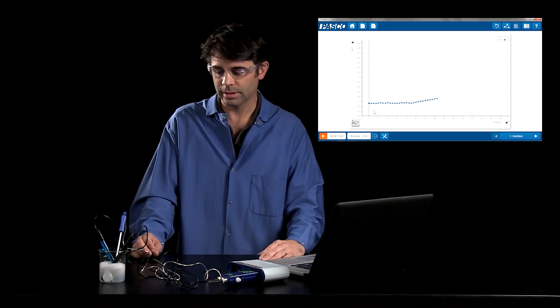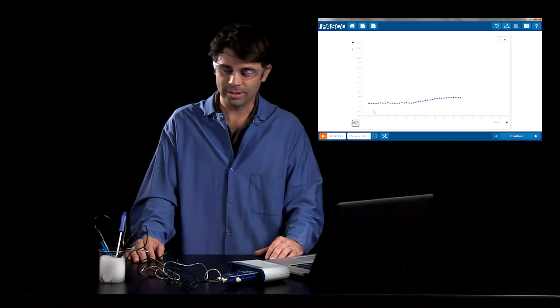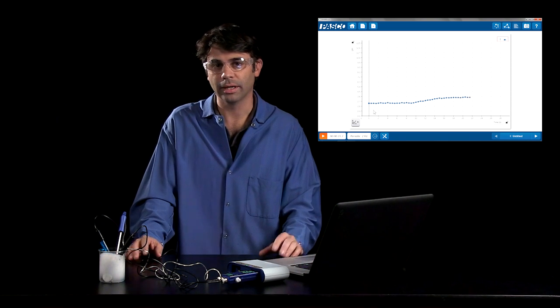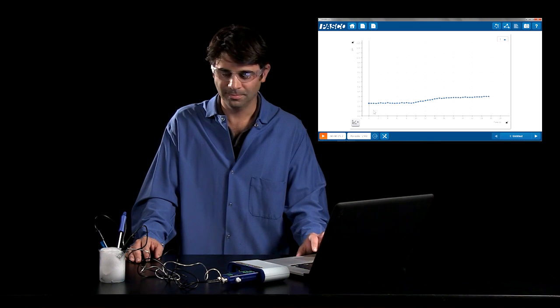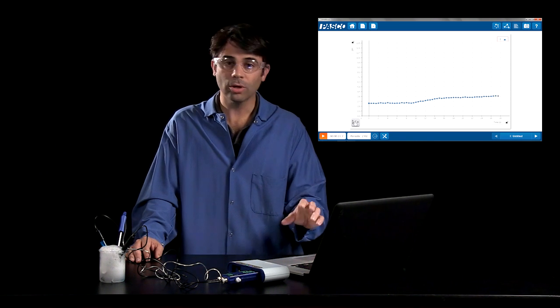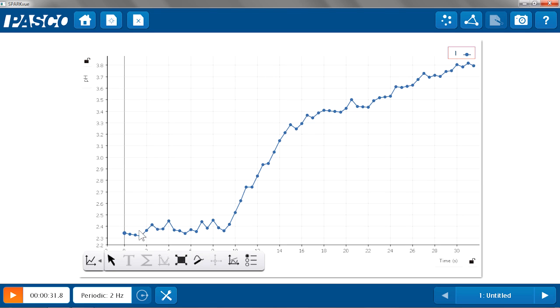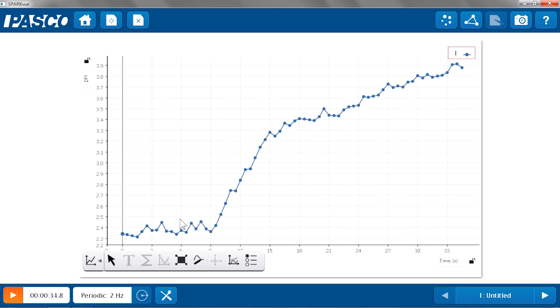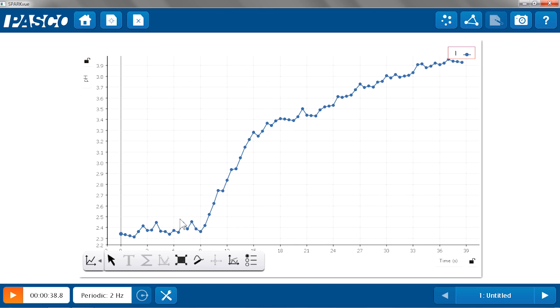It's a weak acid, so I have a low, but not too low, pH. I'll add my Alka-Seltzer. We get our characteristic bubbles of CO2 forming, and we can see that the pH is changing because of that, the Alka-Seltzer being an antacid, or a base in this case. We'll autoscale this, and we'll see how the pH is changing. There's a pretty dramatic rise in the pH as the reaction proceeds, the bubbles form, and the acid is beginning to be neutralized.